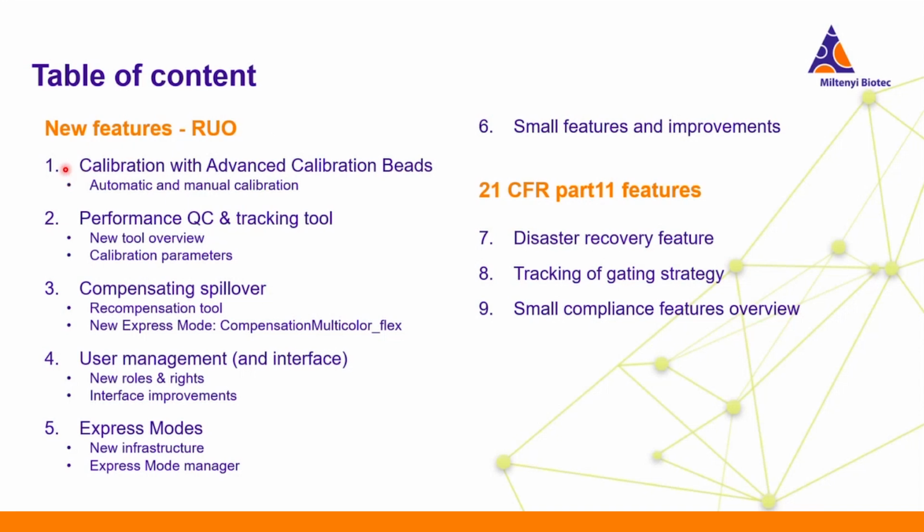As you might already know, there is a new type of beads. We call them advanced calibration beads. We will briefly introduce the performance QC and tracking tool. Then we talk about compensation. There are two new things here.